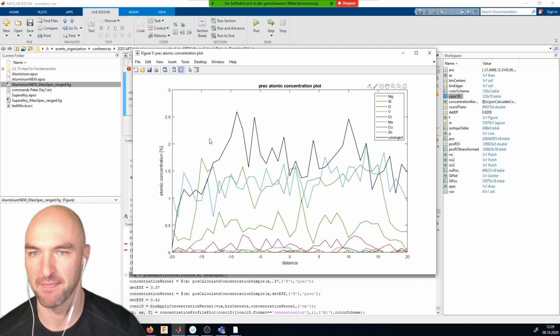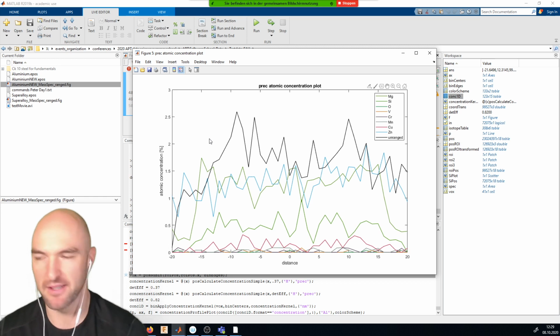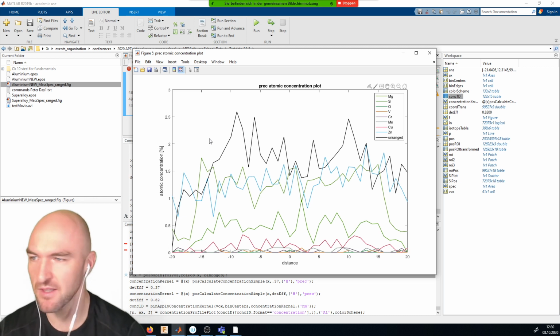So then, for example, if you wanted an error bar, you're going to need to multiply that by whatever factor you want to get whatever confidence interval you want to apply. Because you probably want something like a 95% confidence interval for your error bar. Can we maybe get a comment from Dave Reinhardt on that? Do you know what the confidence interval is? I don't know off the top of my head what the confidence interval is in IVAS that's used for the error bars. I can't remember if it's 1 sigma or 2. So 2 sigma would be 95%. I thought 3 sigma is 95, or 3 sigma is already... 3 sigma is 99. Okay, so 2 sigma would be 95. Okay, yeah, so there or thereabouts.